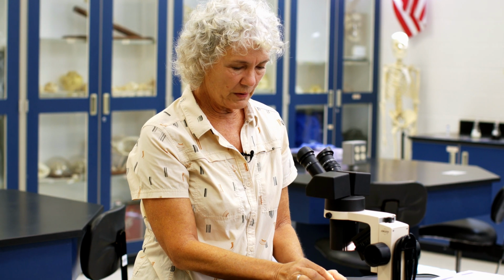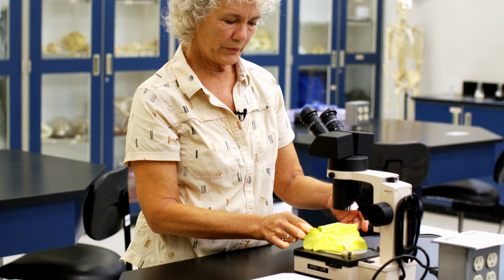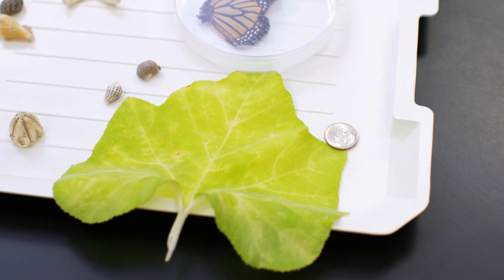All right, so if you had something that you can see through, for example, this leaf, then I might especially like to use the bottom light as well, or just by itself, because I could see the vein pattern in the leaf with the light shining through the leaf itself.